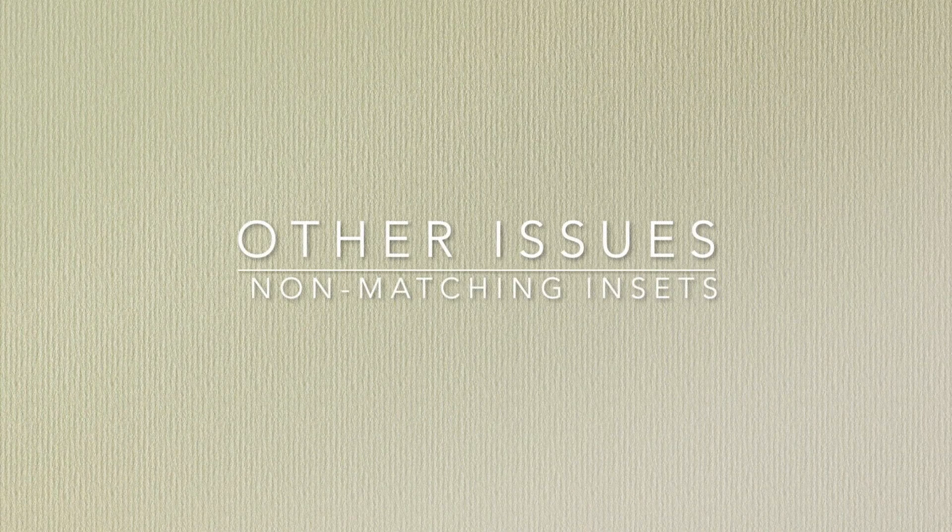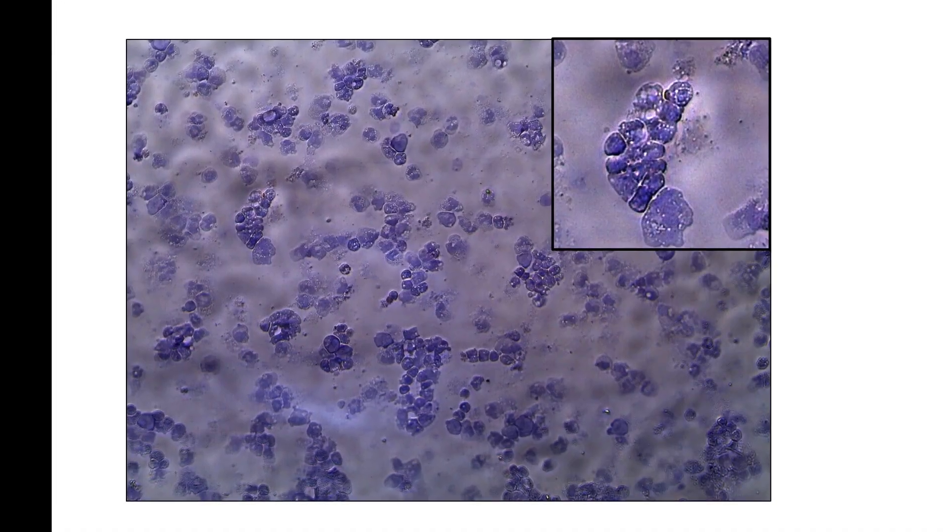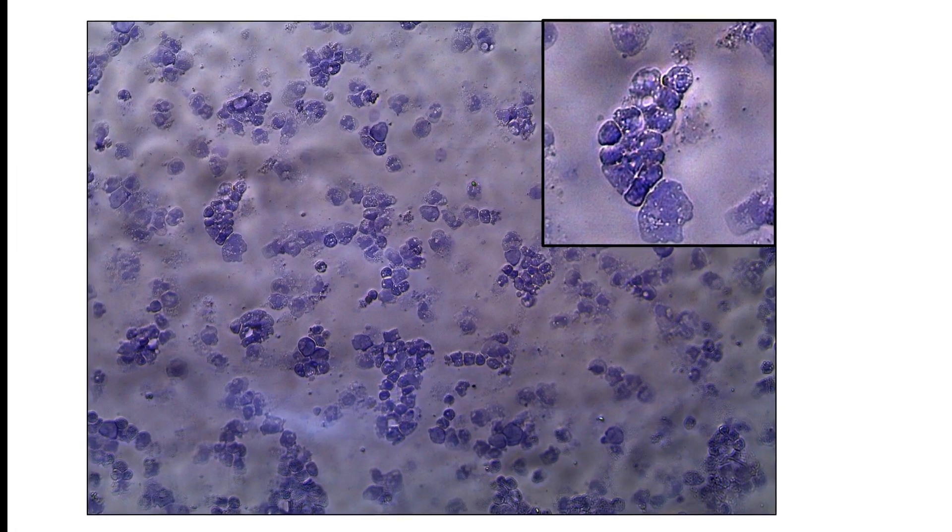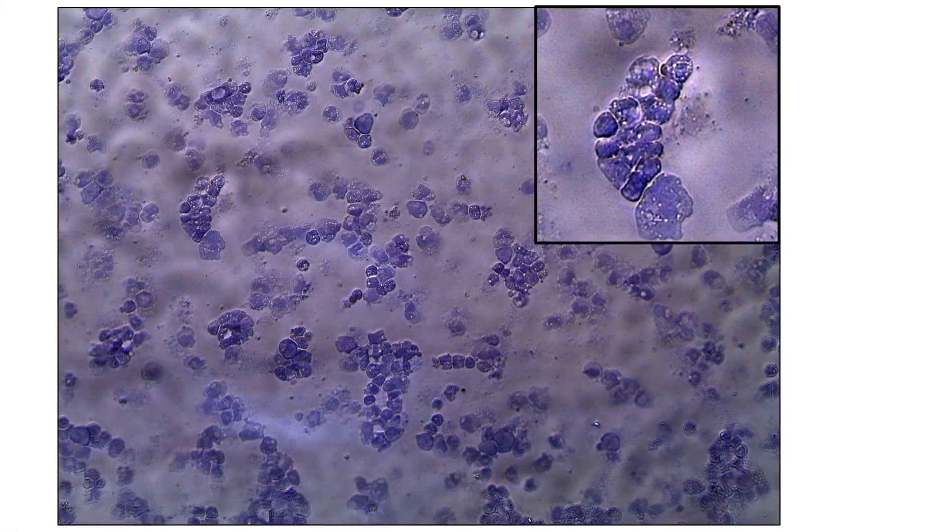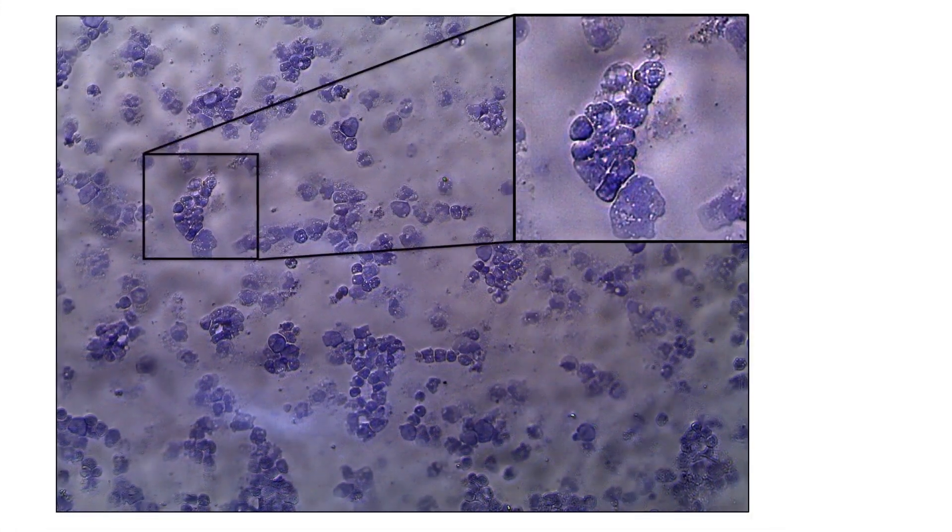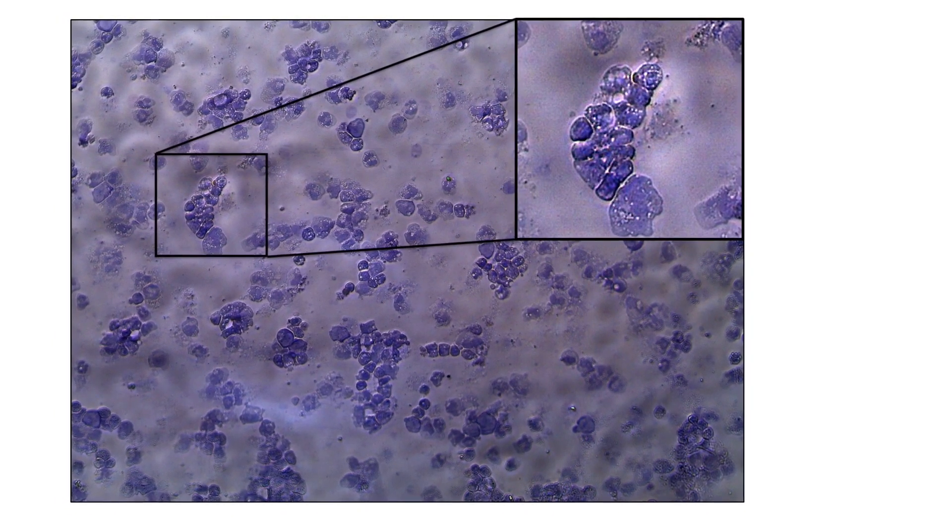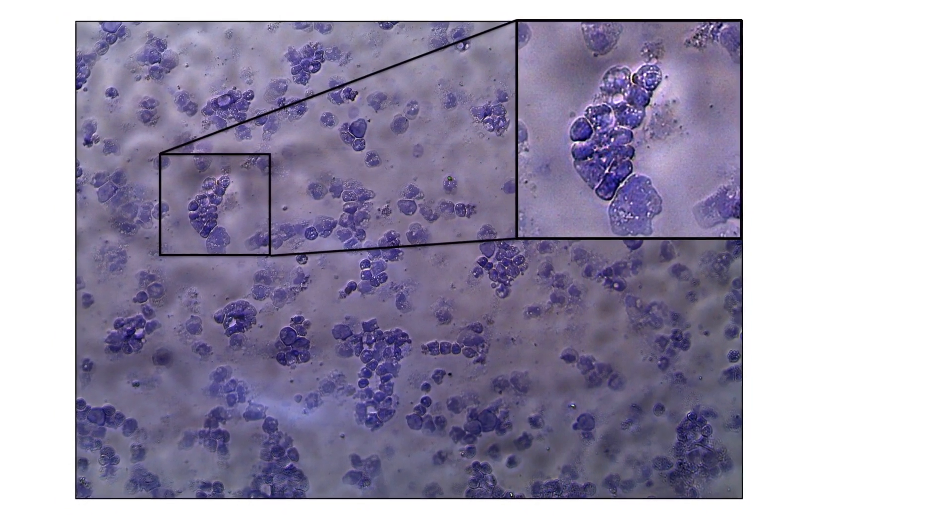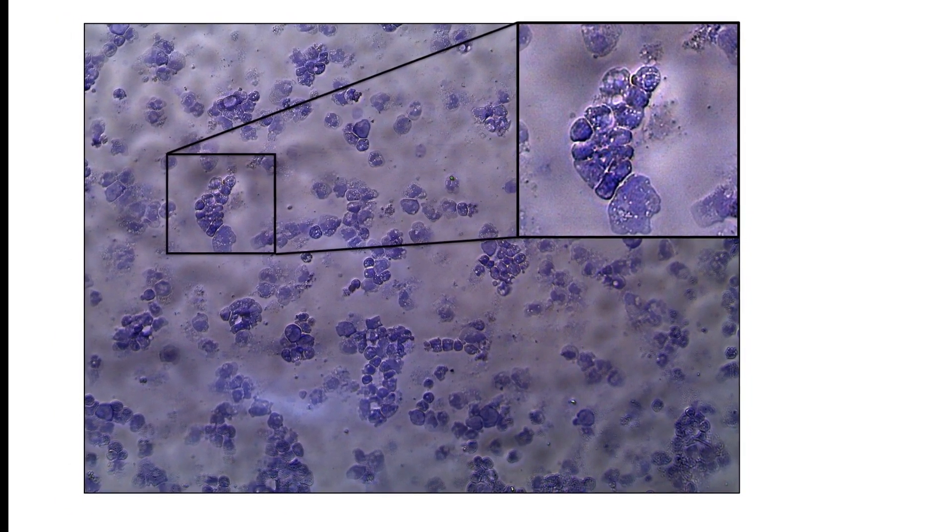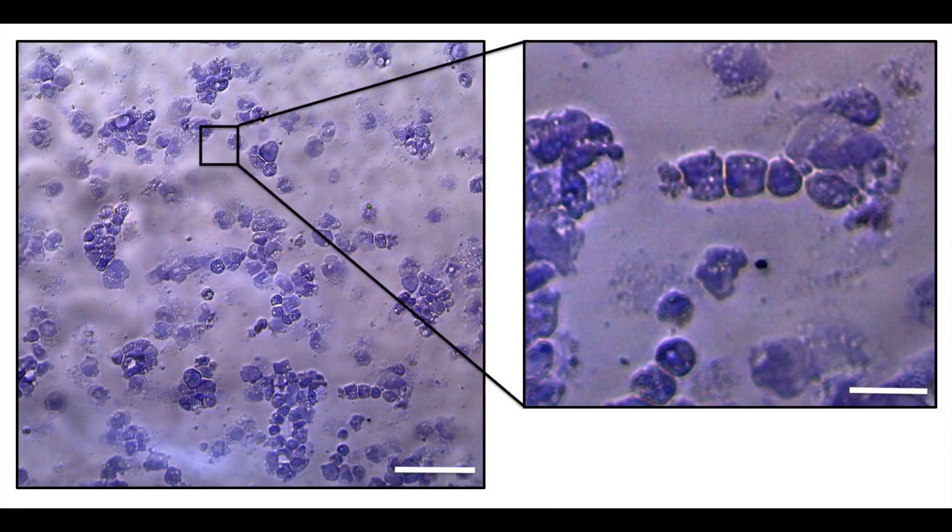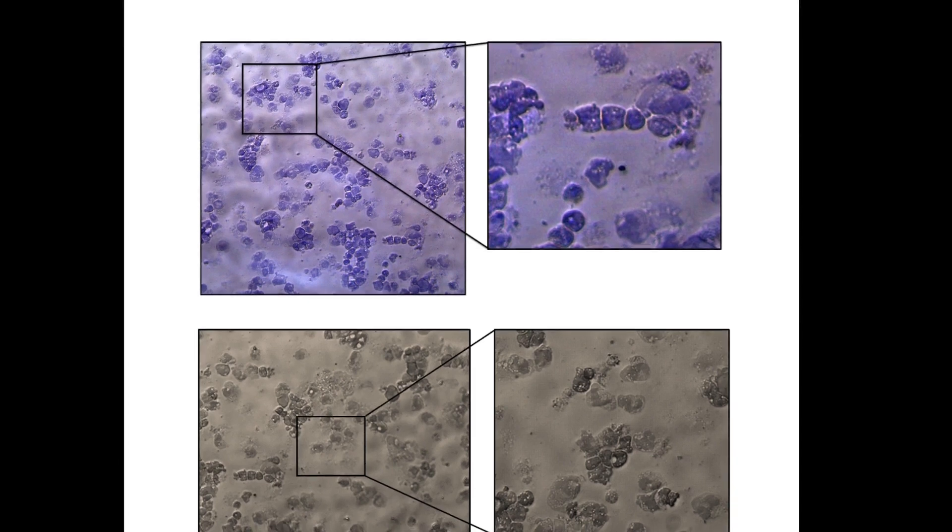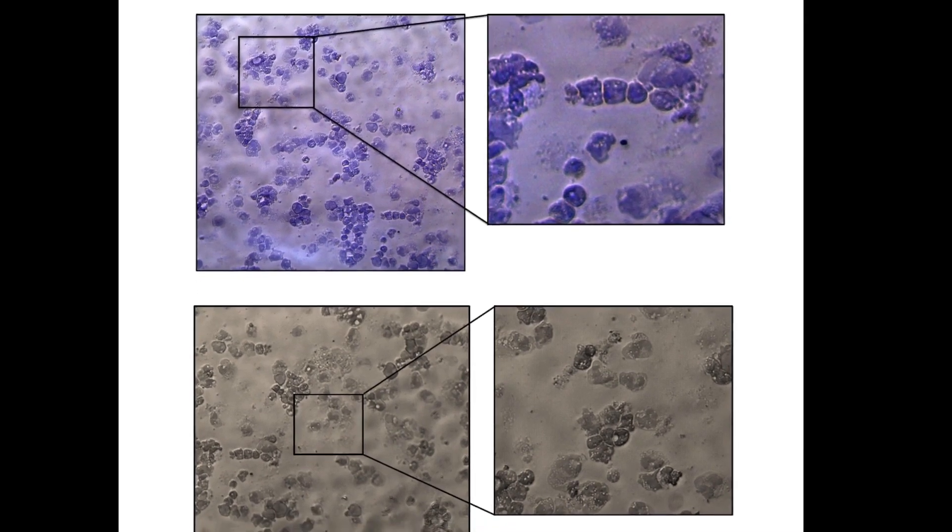Further issues that we encounter on a regular basis and that should be flagged up are non-matching insets or side panels. When close-ups are shown next to an image, the magnified section depicted in the inset should ideally be marked clearly in the corresponding panel, like in this example. However, we sometimes find that the panel showing the magnified image does not match the section indicated. Sometimes the selection is just marked incorrectly, and in some cases the images may not correspond at all.